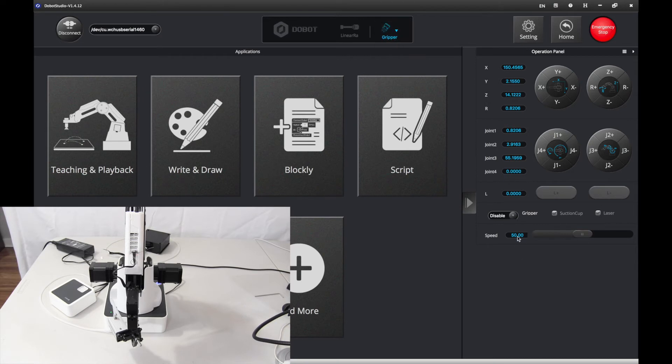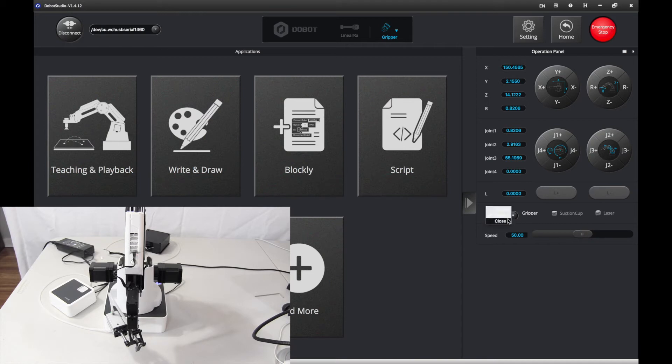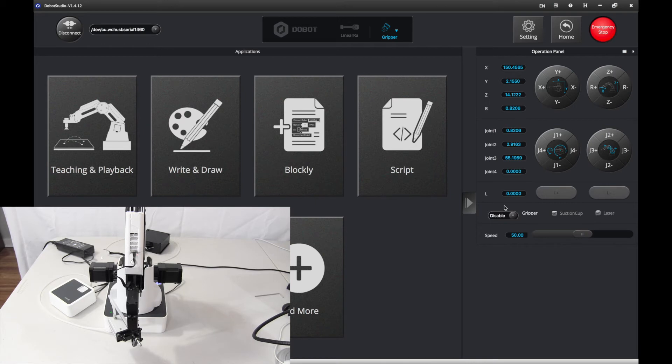Now, let's try opening it. There we go. That gripper opens. And let's try closing it. And disable just closes it all. That's working. That's good.